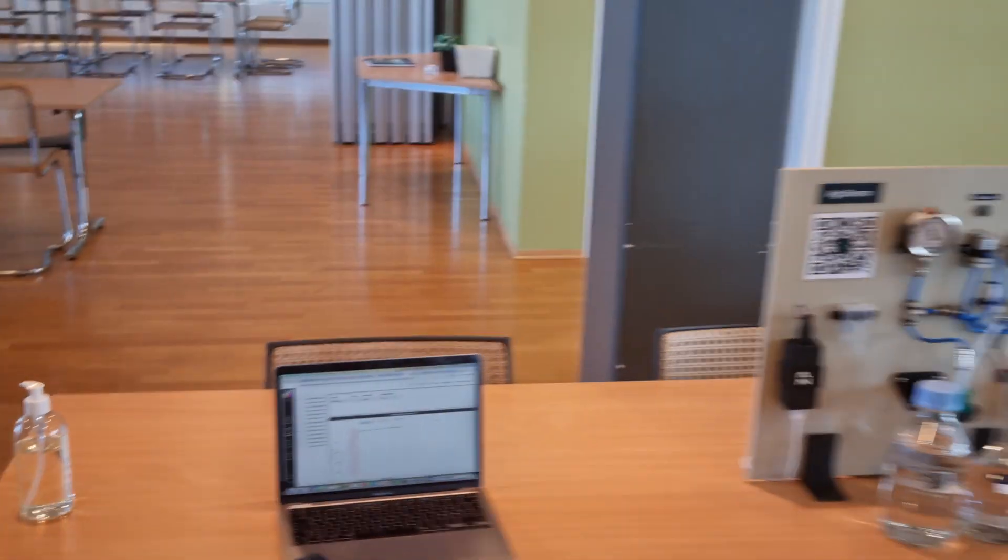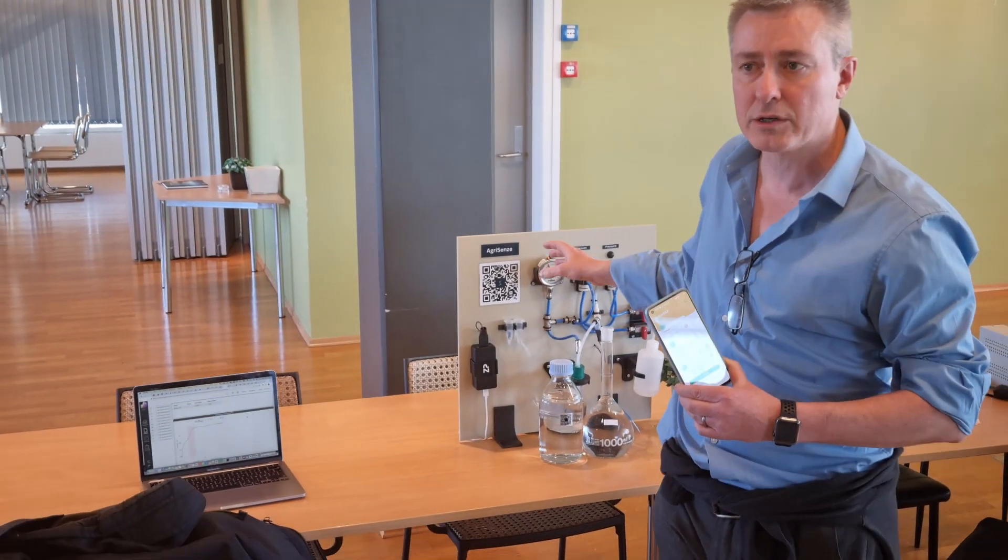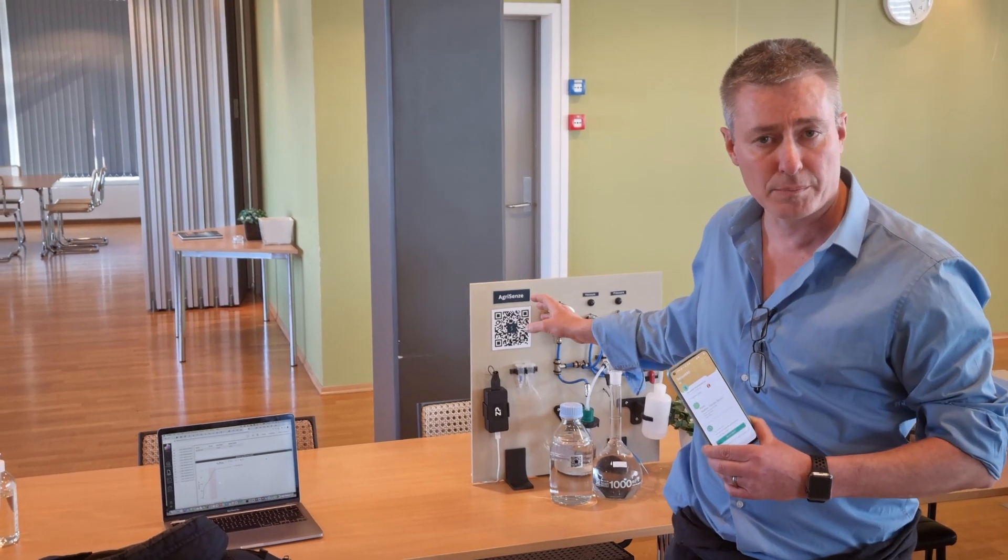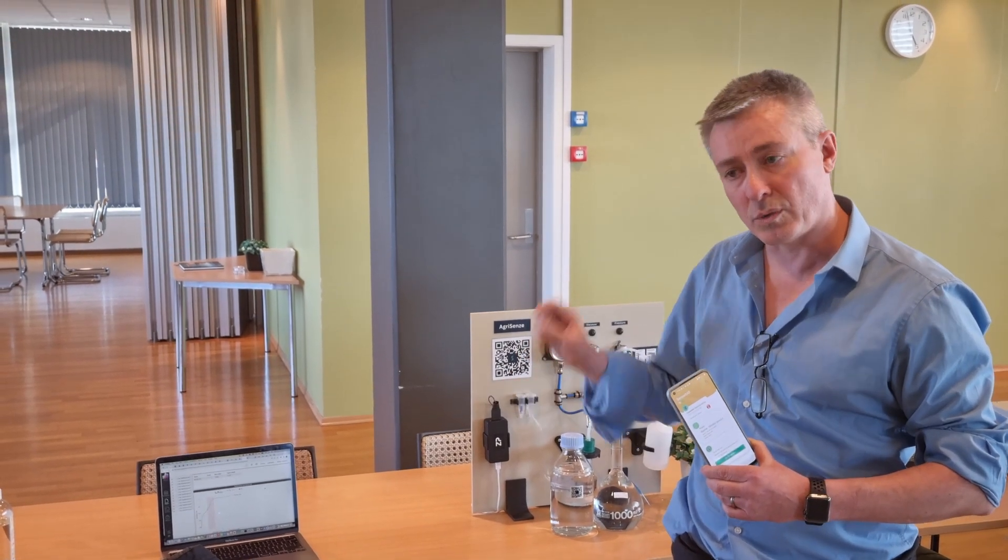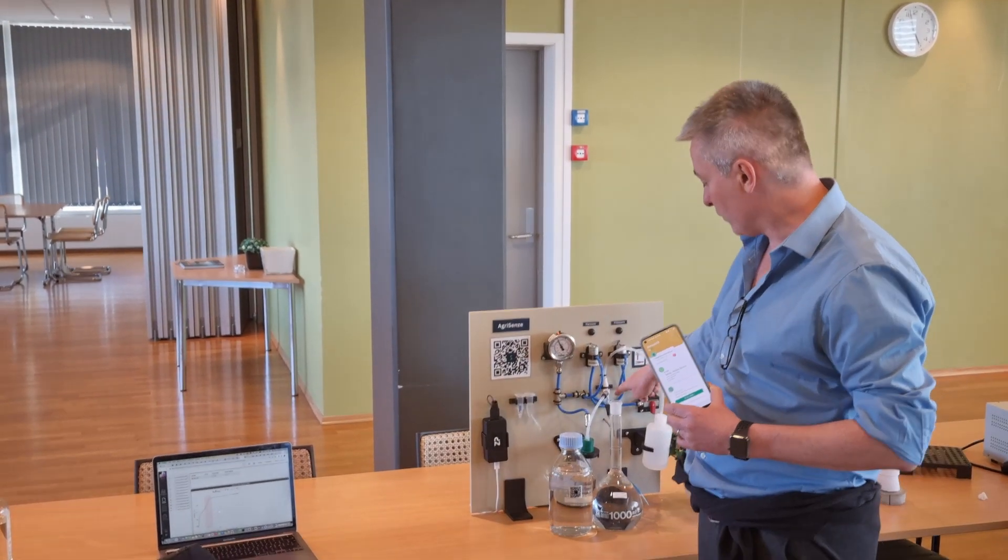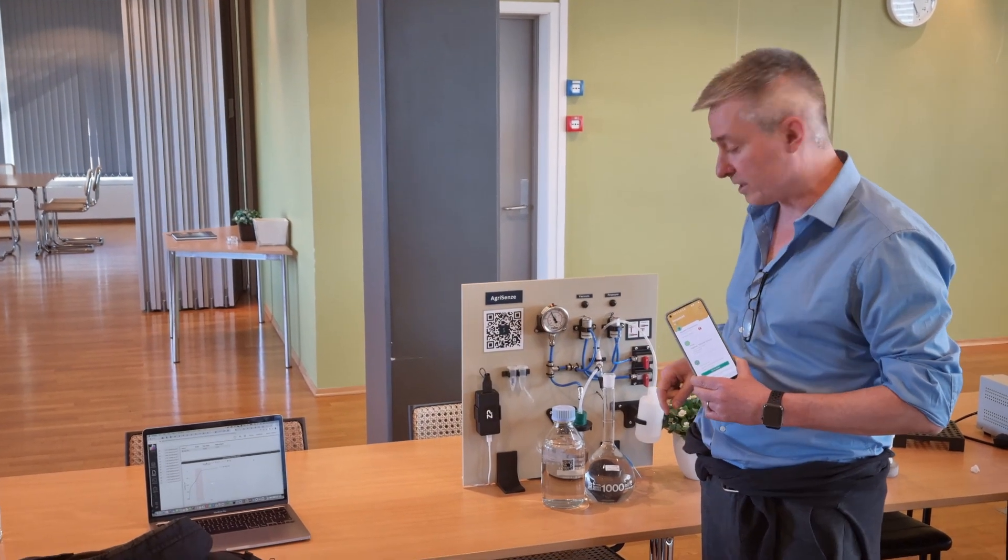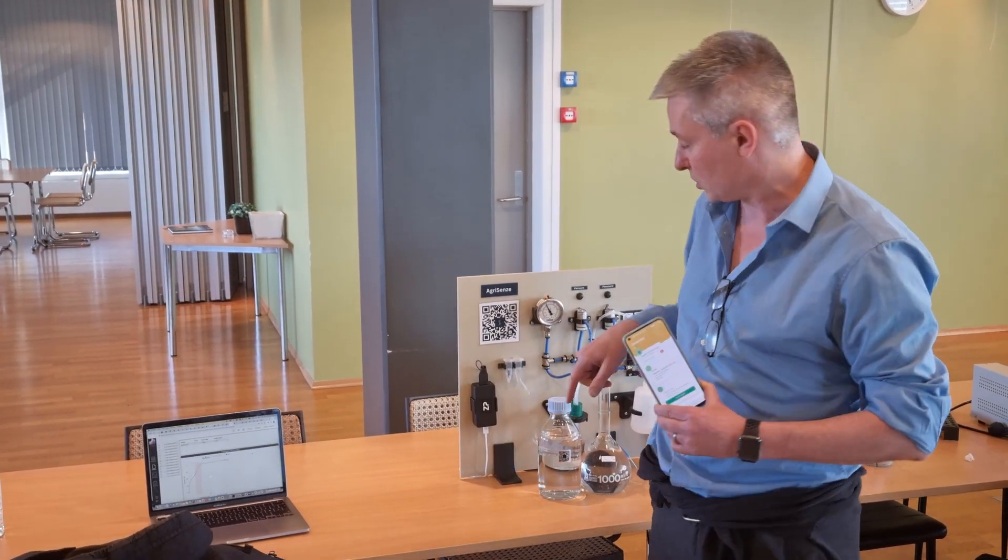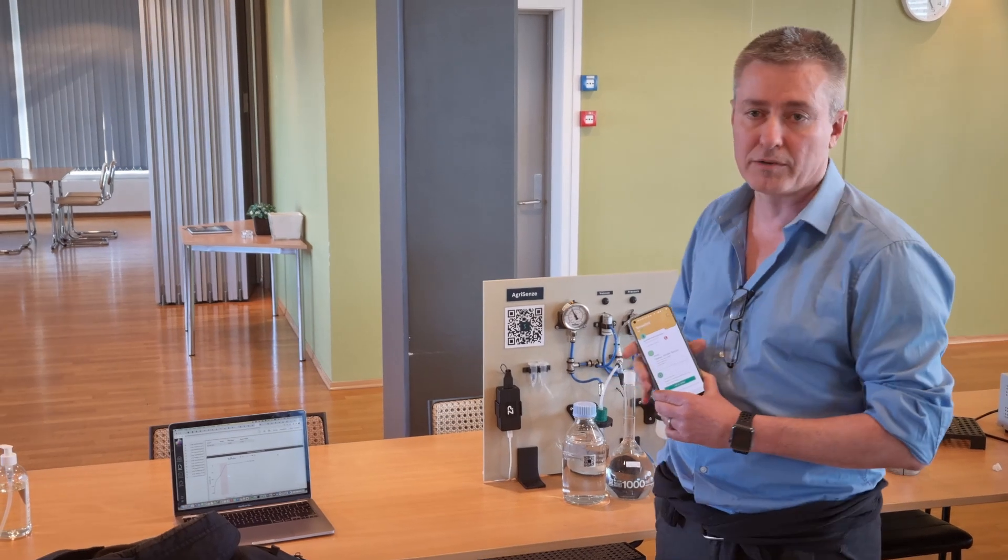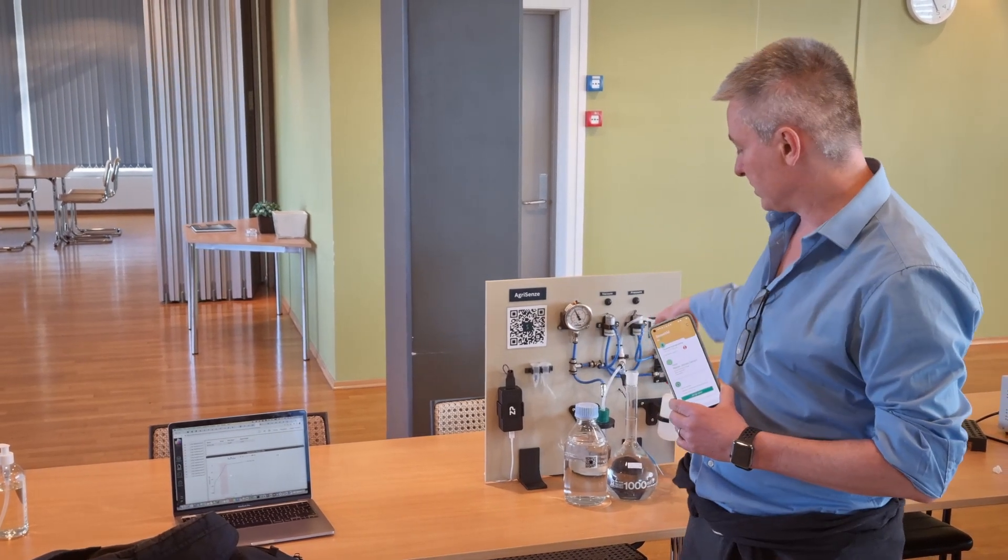So in summary, this is a liquid sampler able to pull from a liquid reservoir, put the sample over a sensor, send the sample to waste - it could be returned to the reservoir if you wish. It does it by a couple of simple pumps, we've got the sensor in line.